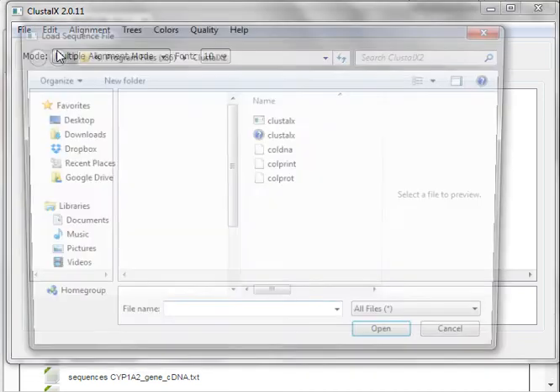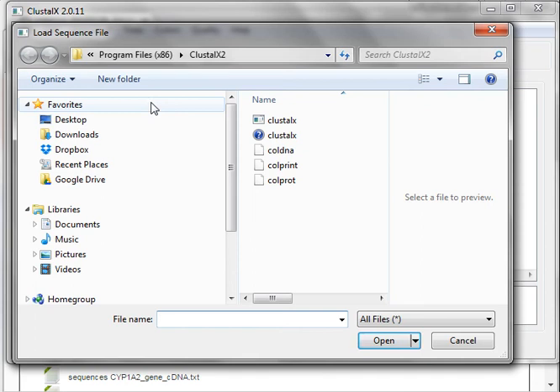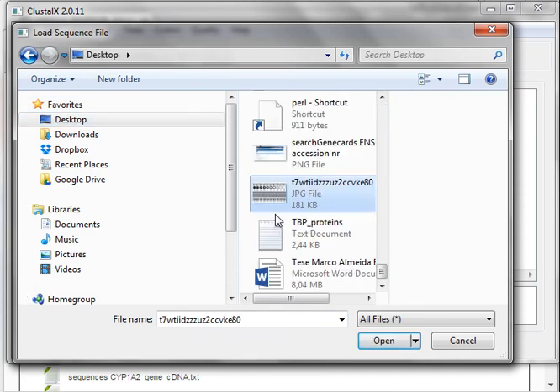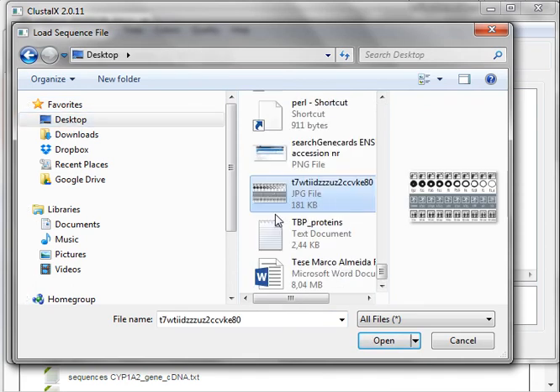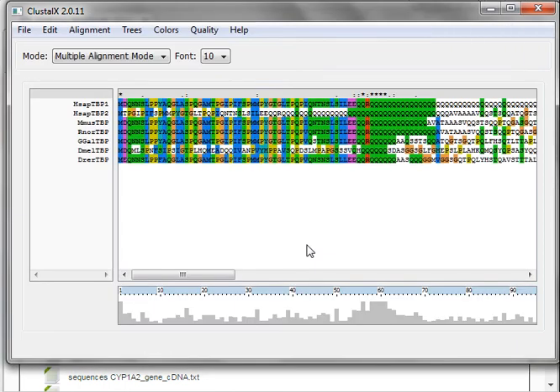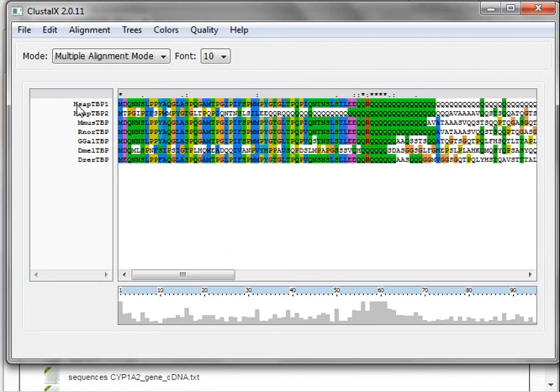You load all sequences at once. You will use TBP proteins. You will align proteins. The file must be on FASTA format as you already learned. And in FASTA format, you should edit the name of each sequence.